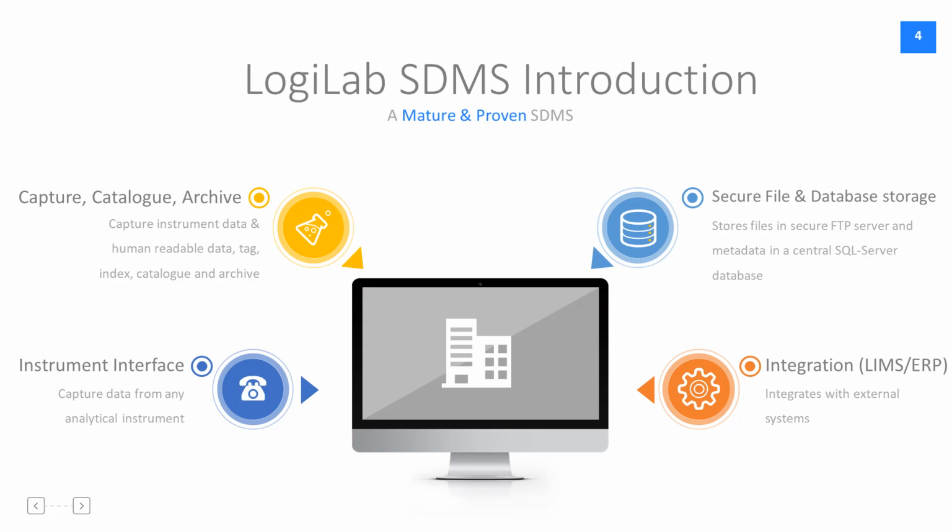LogiLab SDMS is very good for interfacing your laboratory instruments by capturing data from any analytical instrument, be it a PC-controlled instrument or a standalone instrument. Data can be captured and archived.